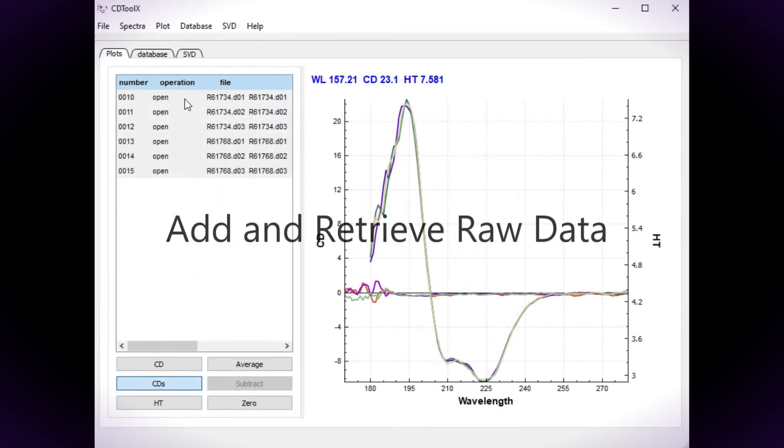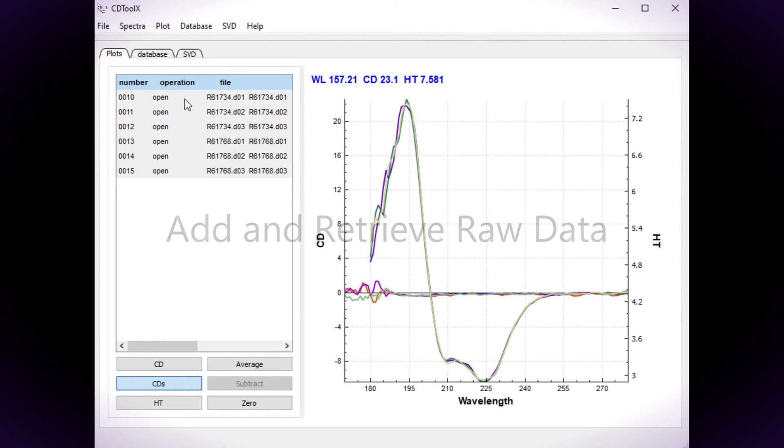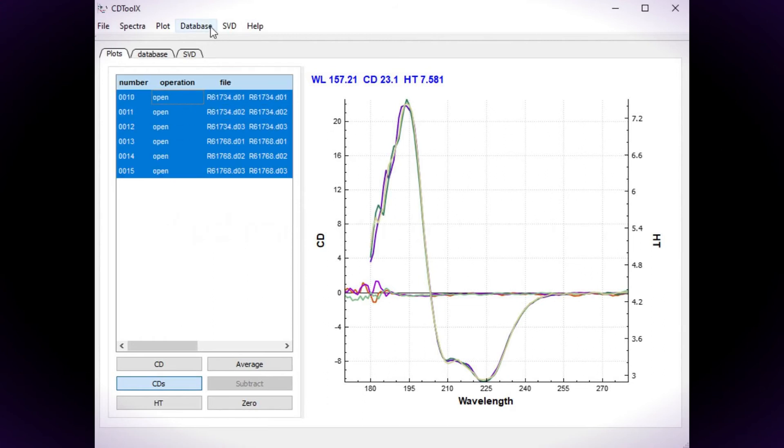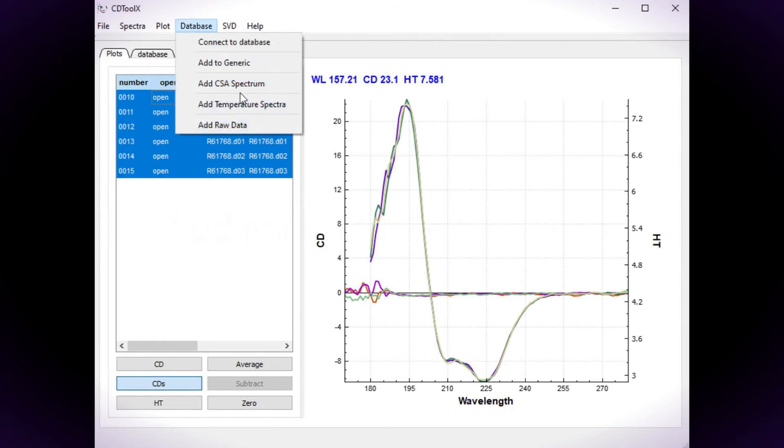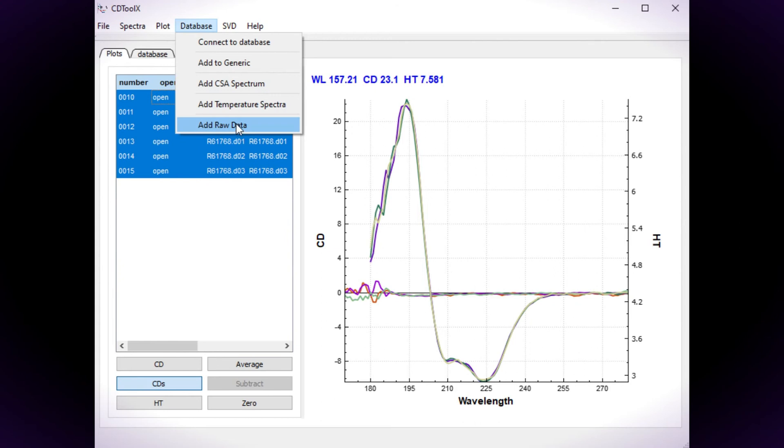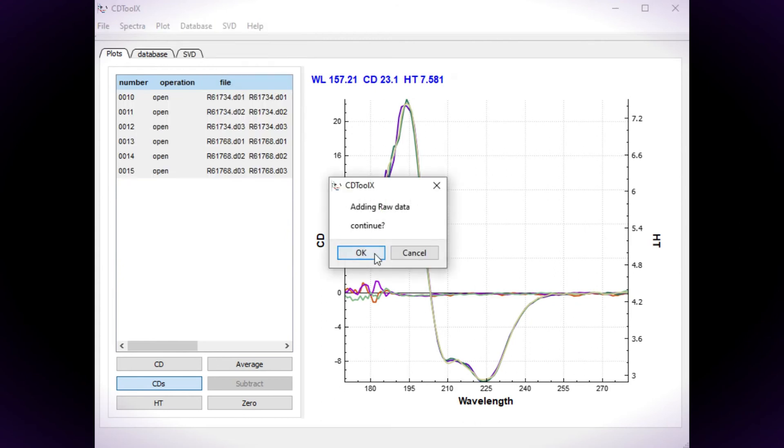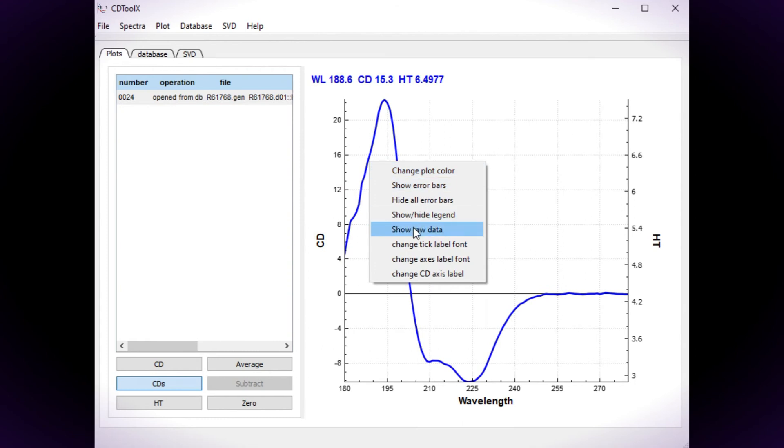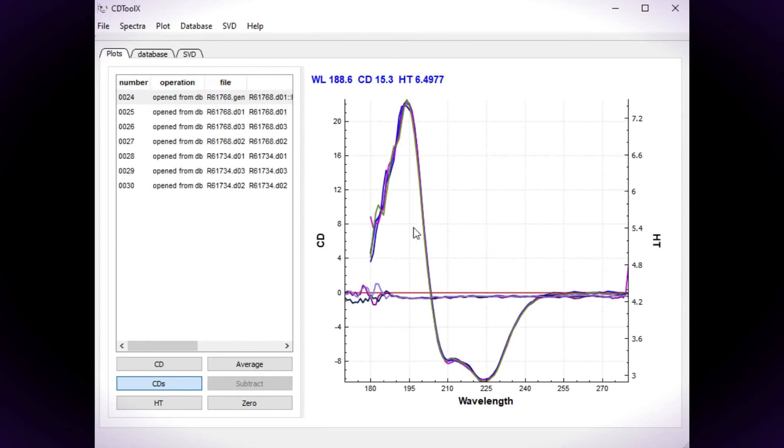The raw data, i.e. the repeat sample and baseline scans, can also be added. Select the data and choose Add Raw Data from the database menu. To view the raw data, right click on a spectrum in the plot window and choose Show Raw Data from the menu.